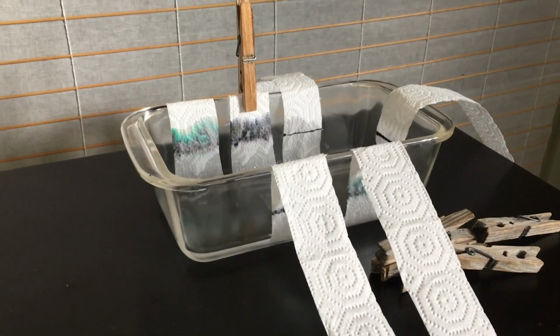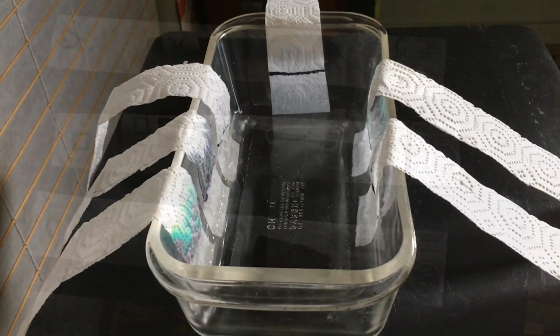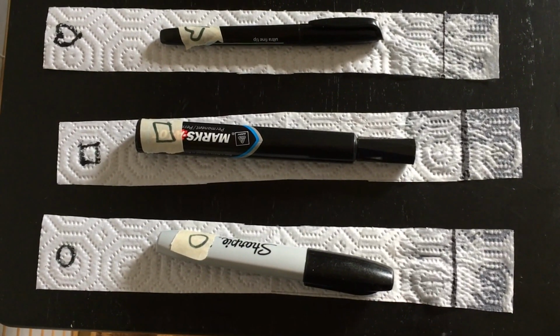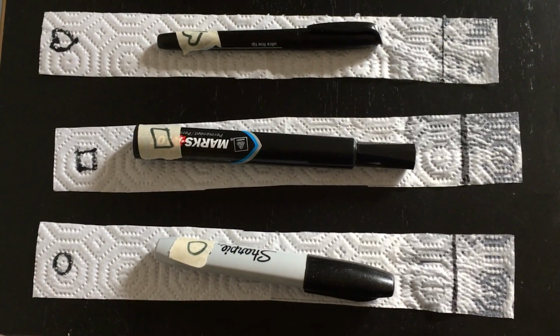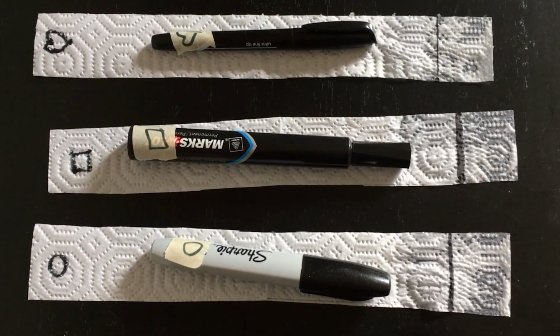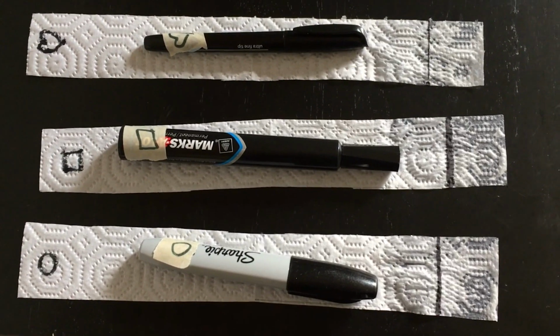Okay, so now I've got all my strips in. Let's take a look at our result. So 3 of these really didn't do anything. You can still just see the line, the black line right across the bottom where the water has gone through. And those are all non-water-based inks. So now we know this experiment does not work with non-water-based inks.